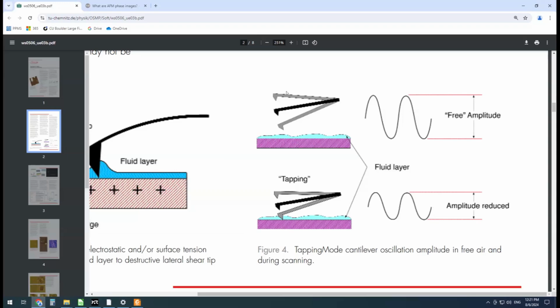And ideally, the cantilever is actually going to be interacting with the surface, touching it. And that physical touch is what's going to reduce this amplitude here. You can imagine all sorts of different modes, like non-contact mode, where we're just interacting with some surface forces, like some van der Waals interactions or some electrostatic forces. But here, I just want to actually physically interact with the sample, have my tip tap the surface. And so this is our free air amplitude. And our set point in our case is 65%.